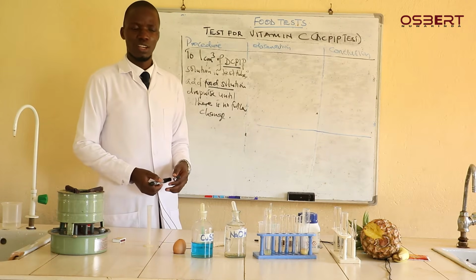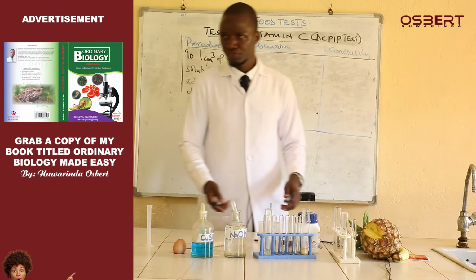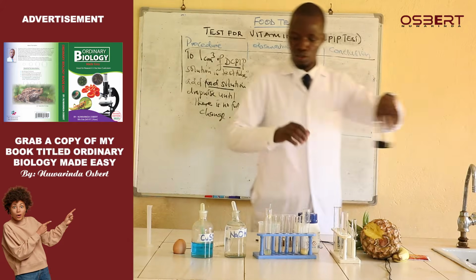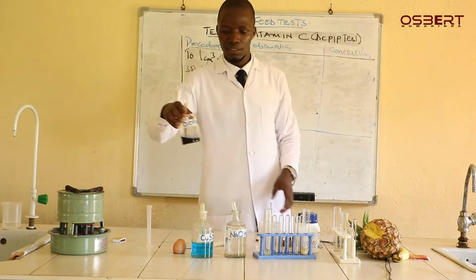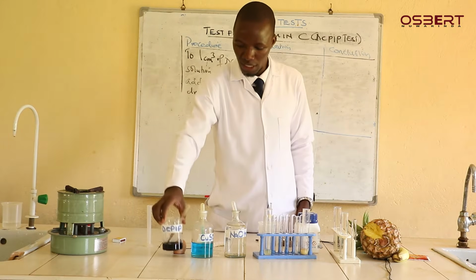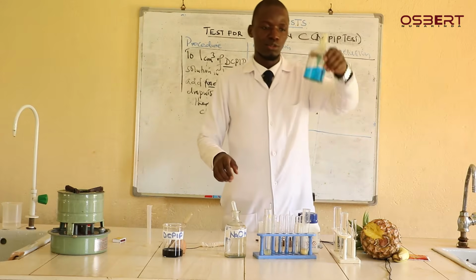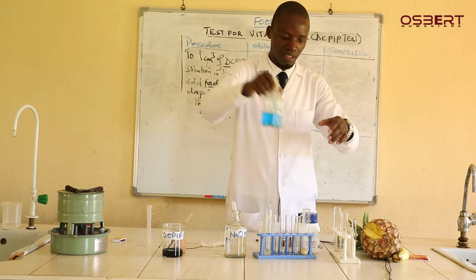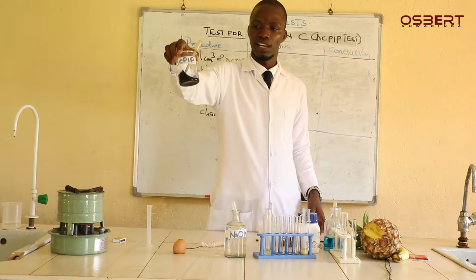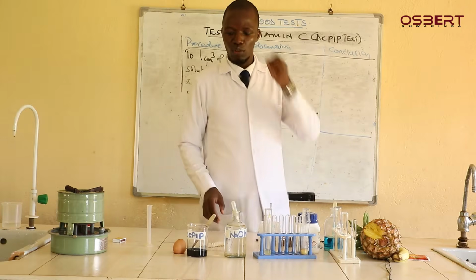And what do you observe? What do you expect? The solution of DCPIP is as simple as the way you see it here. It is blue in color. However, this blue is very different from this other blue. The blue for copper 2 sulfate of Benedict is too light, but this one is a deep blue solution. Some people think it is black, but it is a deep blue solution. So it's what we are going to use.